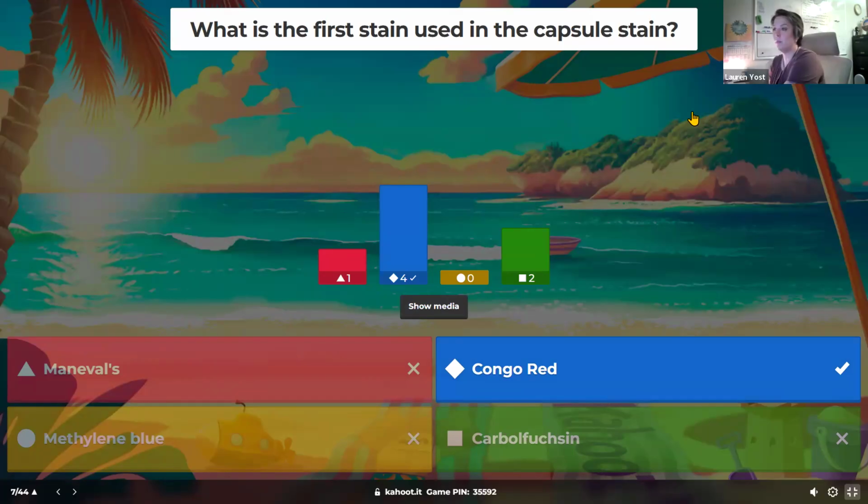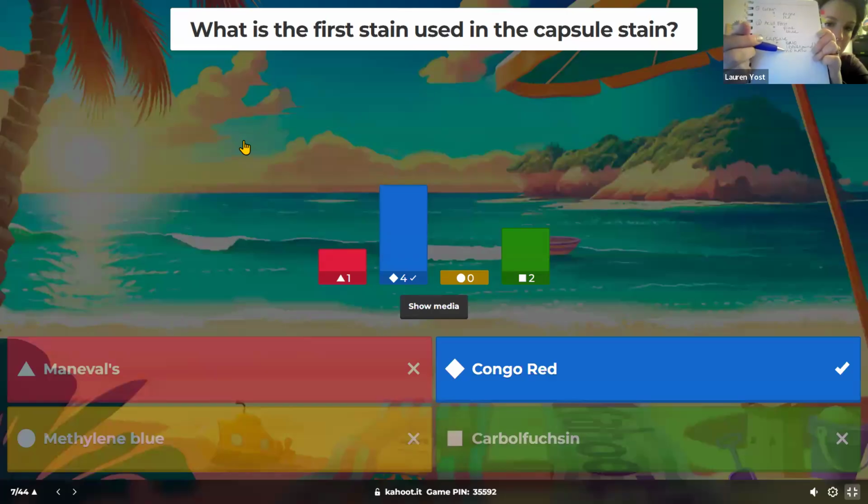So I've got my little list here. I don't have a way to show you on my actual screen, we could annotate it, but I don't have a pen to write with, so it is just my mouse, and it would be horrible if I tried to write on this. Just briefly, this is what I have so far. I've got my gram stain, what positive and negative look like, acid fast stain, what positive and negative look like, capsule stain, what positive looks like, a halo, versus negative, no halo. And I put background on here to remind me that's how you know if you have a halo or not. Okay. All right. And then our last one, our fourth staining procedure, was our endospore stain.